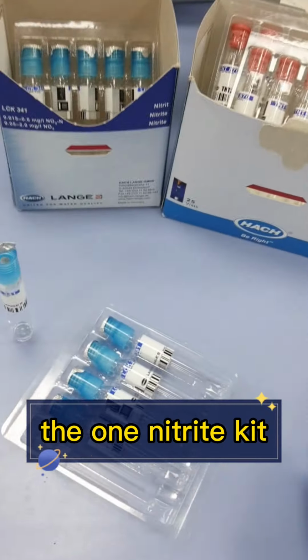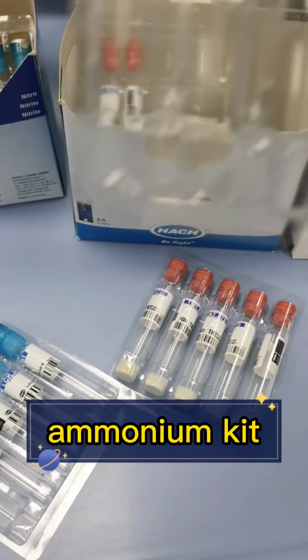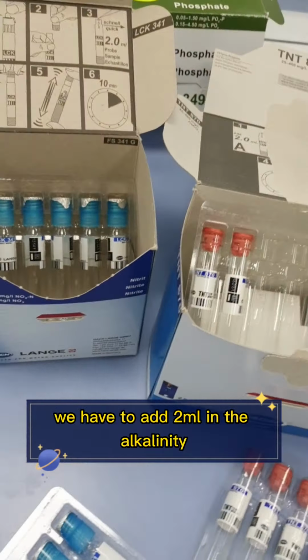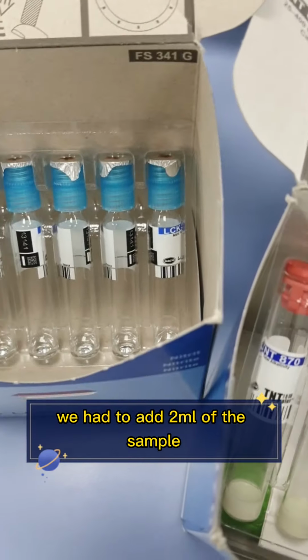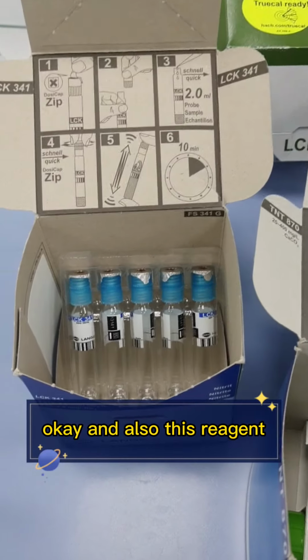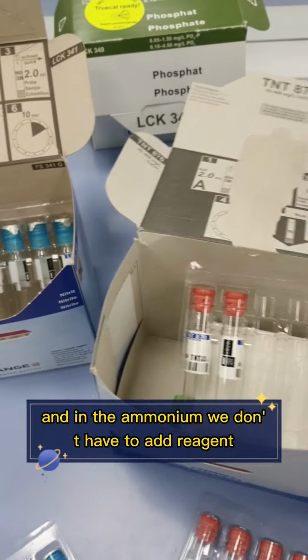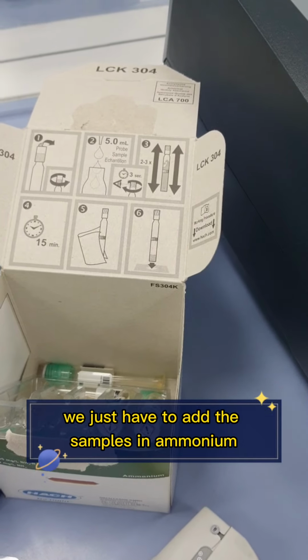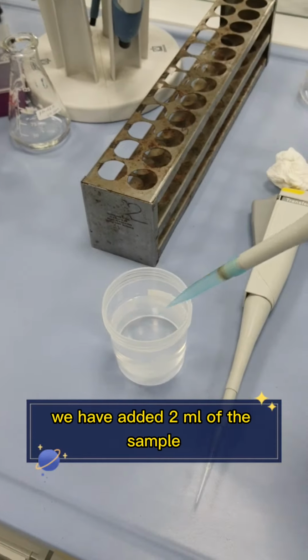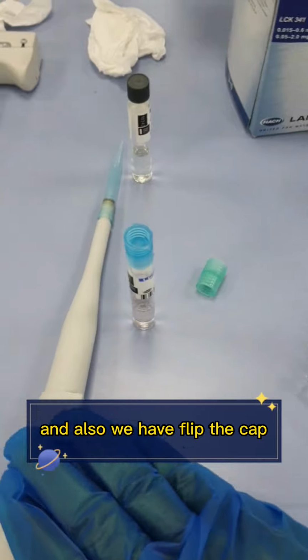This is our nitrite kit, and this is our alkalinity kit, and this is our ammonium kit. So in the nitrite we have to add 2 ml. In the alkalinity we had to add 2 ml of the sample. Okay, and also this reagent will add. And in the ammonium we don't have to add reagent, we just have to add the samples. In nitrite, we have added 2 ml of the sample. You can see that the color is changing, and also we have flipped the cap.